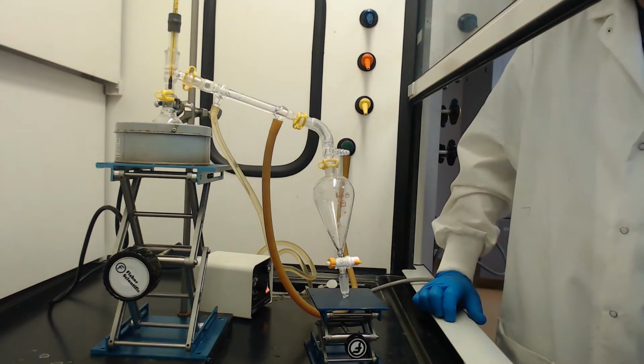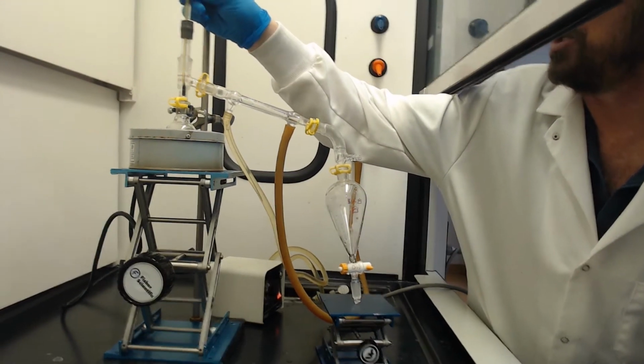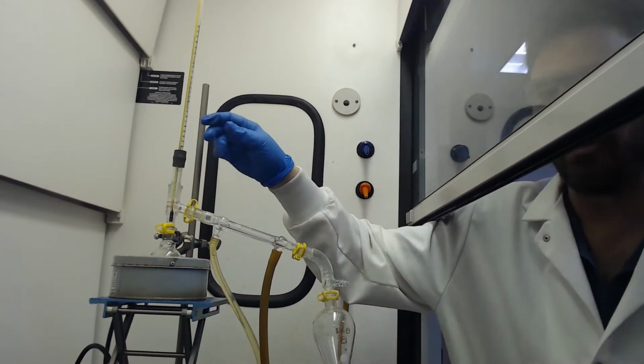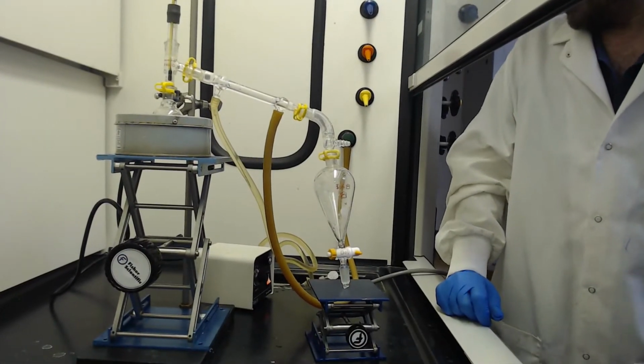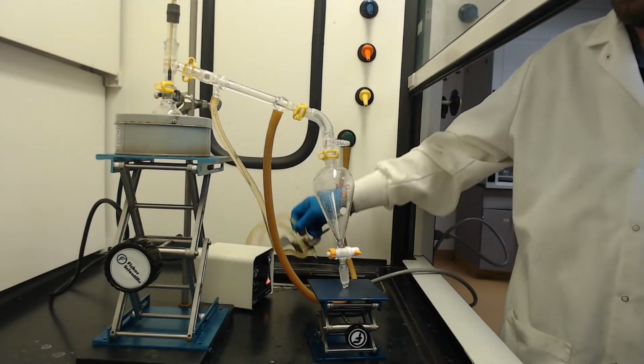All right, so right now we're starting. We can look at our thermometer, and it's about 21.5, we'll call it. Okay, room temperature. Nice, pleasant room temperature. So a little bit of water flow still. Everything's good.